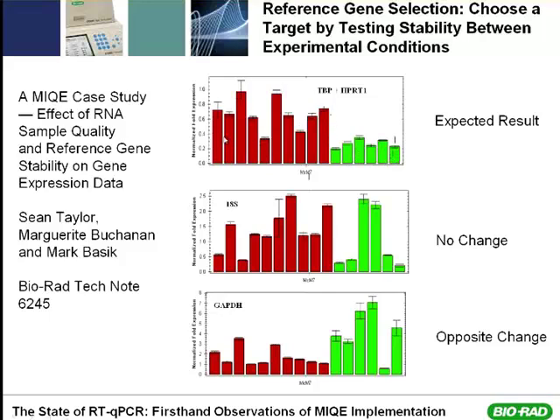tissue and tumor tissue. Here we normalized by TBP and HPRT, which were found to be stable reference genes. So we normalized by the average of TBP and HPRT in this particular study, and we found that we had a nice significant increase in expression between the green, the normal samples, and the red tumor samples with a p-value of 0.0007. So very nice and expected increase in regulation for MCM7 between normal and cancer.